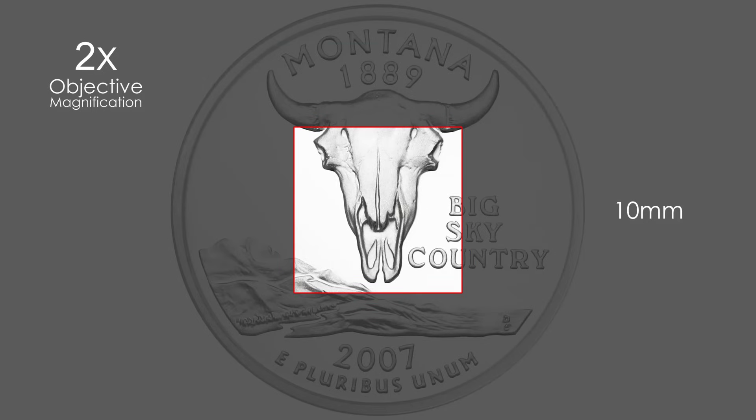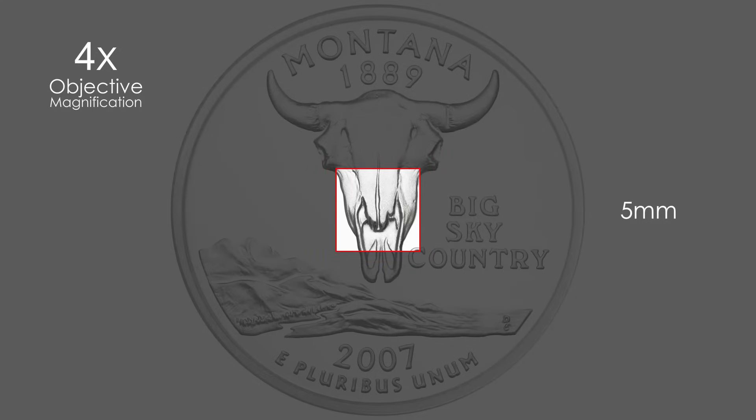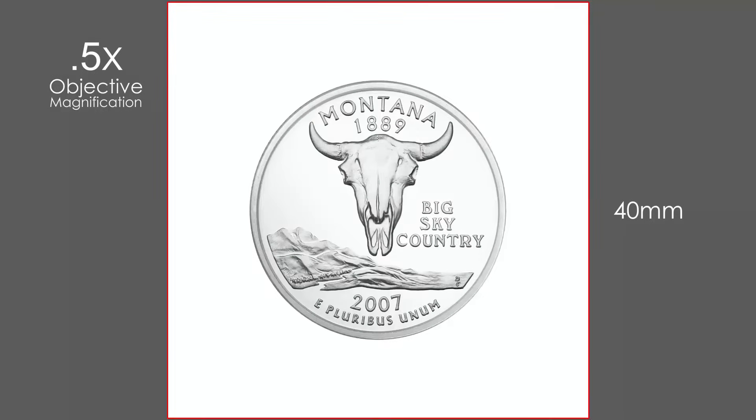At 2x magnification, the field of view is only 10 millimeters, showing a much smaller portion of the coin. And at 4x, it's only 5 millimeters. With a fractional magnification, such as .5x, the field of view is now 40 millimeters, which allows us to see the entire coin.